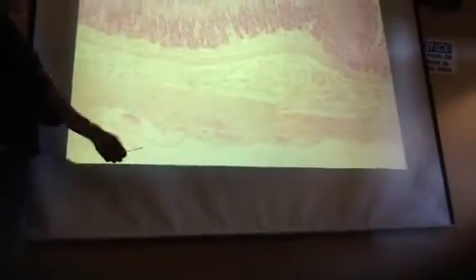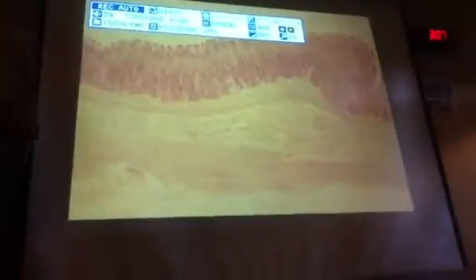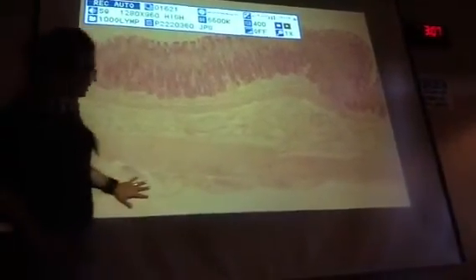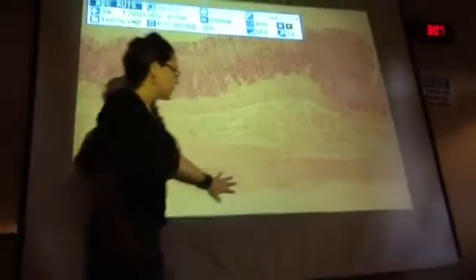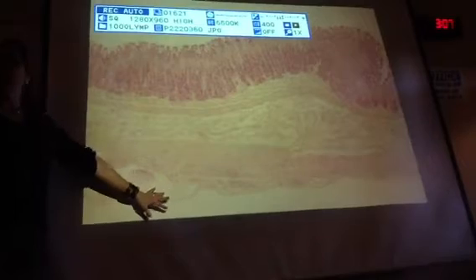And then the very first thing that you need to look for is which side is the lumen side. And the lumen side is going to be on the side where you have the mucosal tunic, where you have the epithelia. Now, looking at this at 4X, it may be hard to tell the difference, but you should see that down here, this does not look like it's darkly stained at all. There is not epithelia down here.